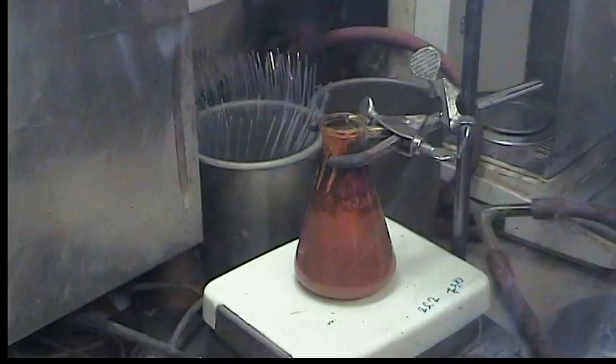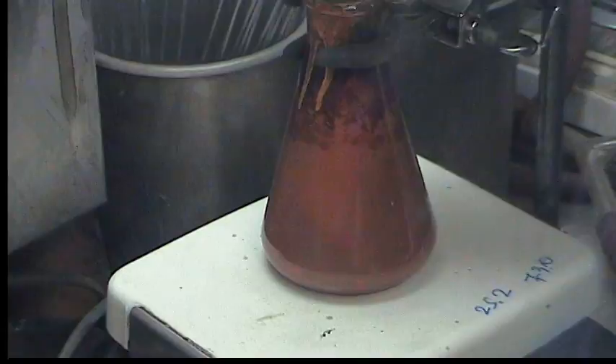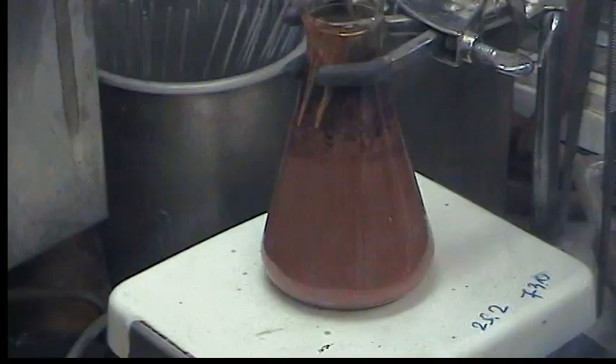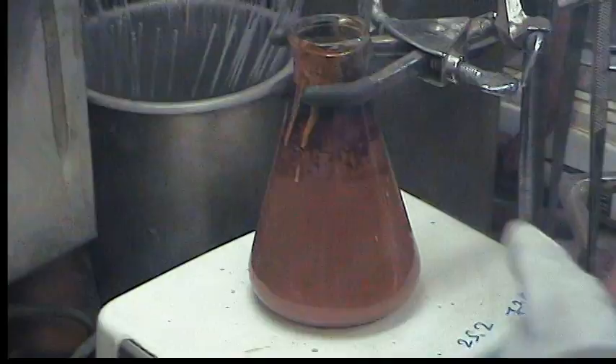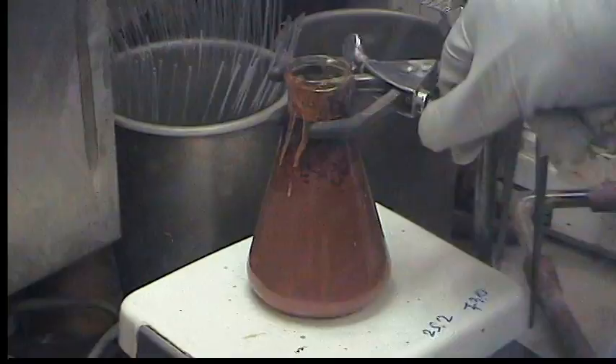So we're just going to stir this for about 3 hours — maybe until 12:30, so that's 3 hours and 15 minutes. It will take on a darkish green color initially and then purple. Once it looks entirely purple, we generally filter it.